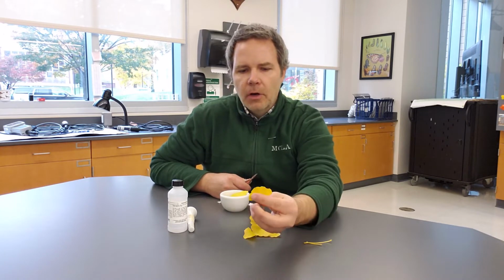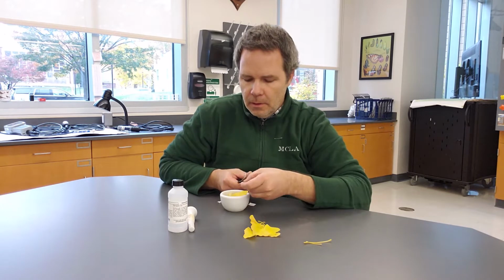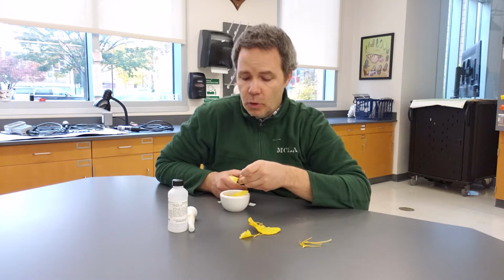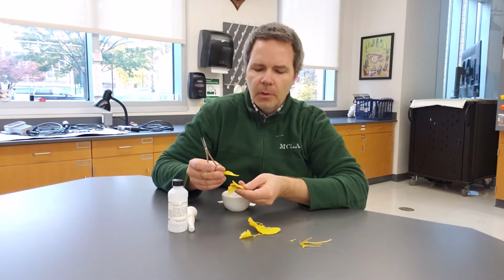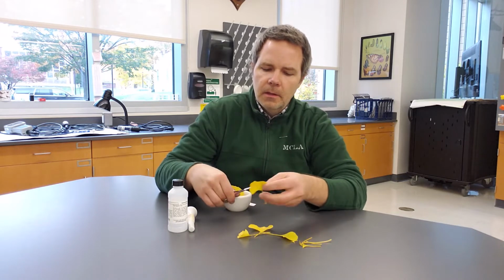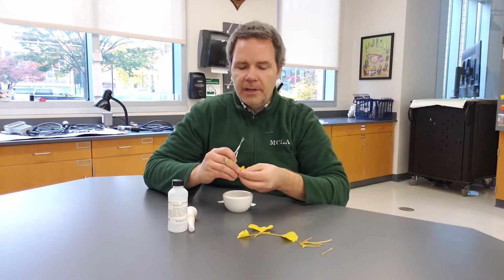Actually, what I have here are Ginkgo leaves. These are very typically turning yellow this time of the year when I collect these in mid to late October. So I'm going to take a few of these leaf blades. I want a couple just to make sure I have enough leaf tissue and enough pigments that I'm grabbing and extracting out of the leaves.